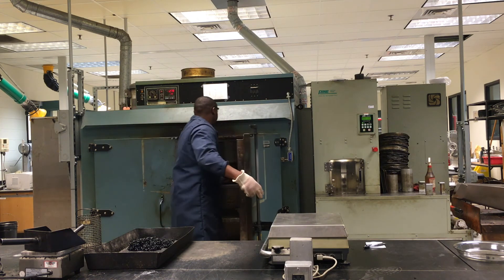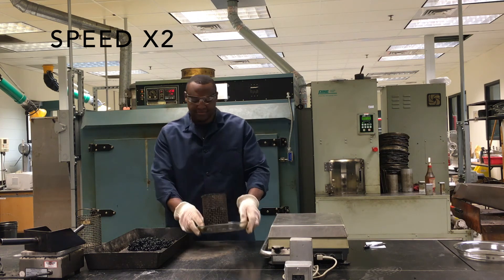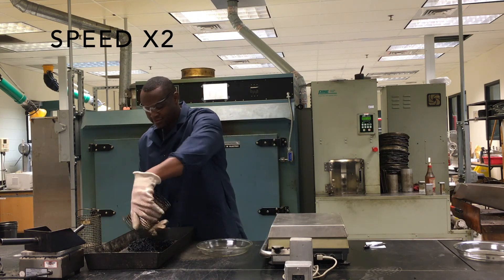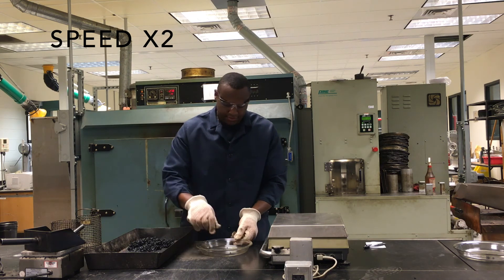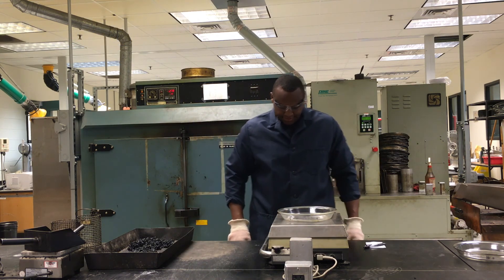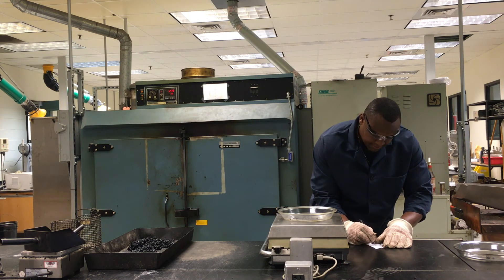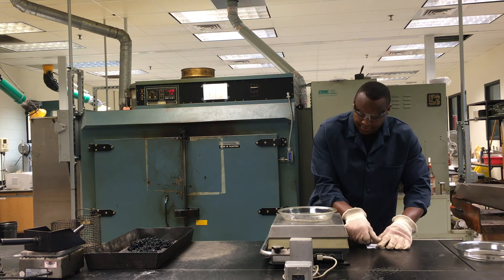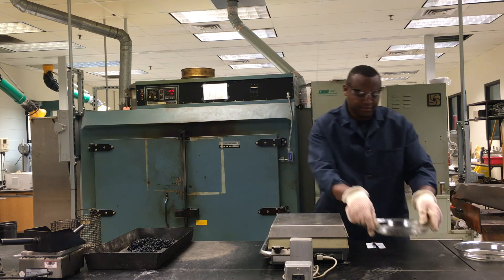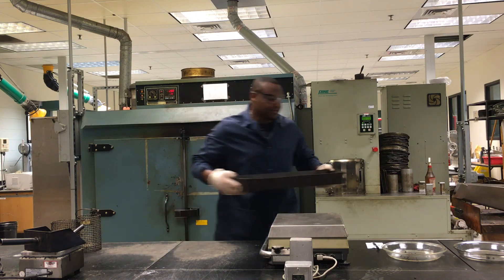Repeat for the second sample. Calculate the percent of mixture that drained and report results to the nearest 0.01%. The reported results should represent the average of the two samples.